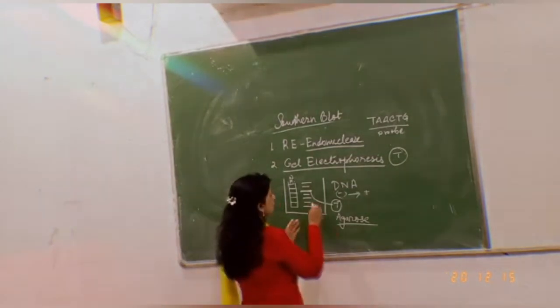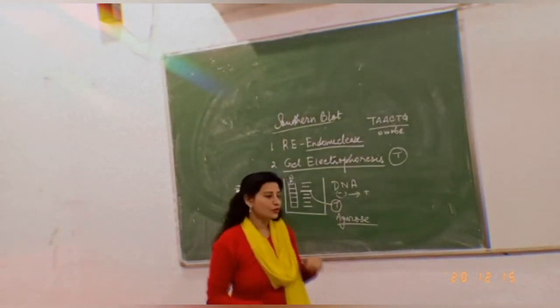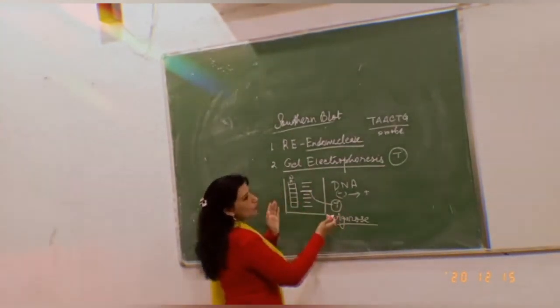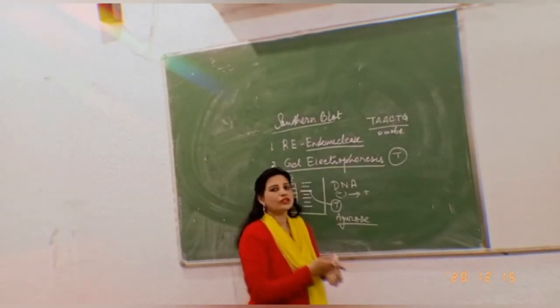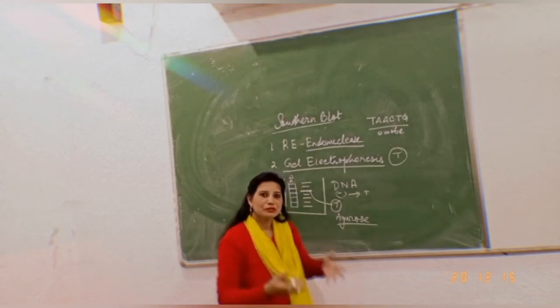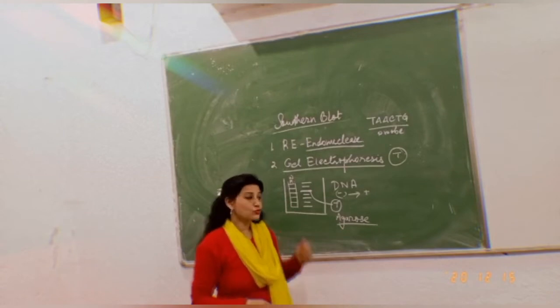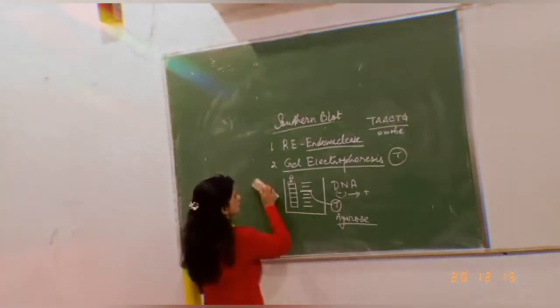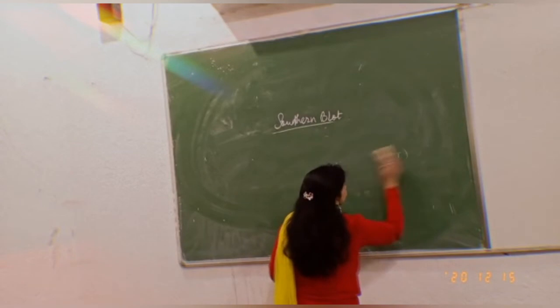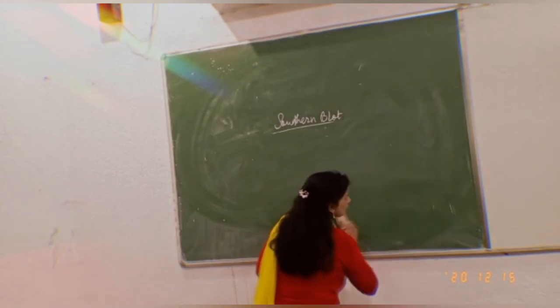But overall, my problem is how to locate this target. I have to do it by another method, because the gel which is used, agarose, is very fragile. Once I try to open up the chamber after switching off the electric field, taking out the agarose gel will create problems for me. It might break off, and some of the DNA fragments will not be understood properly. So there is a big problem. To overcome this problem, the method that will be applied is the southern blot, and here I will be using the nitrocellulose membrane.